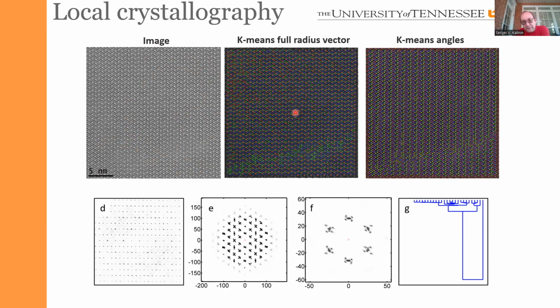But look what happens. Once we've done it, you can clearly see that there is an antiphase defect inside the system. You see that this part is absolutely uniform, this part is absolutely uniform, but there is a line along which the atoms shift by half of the period. And you can see it even better here when you follow the green to red column.